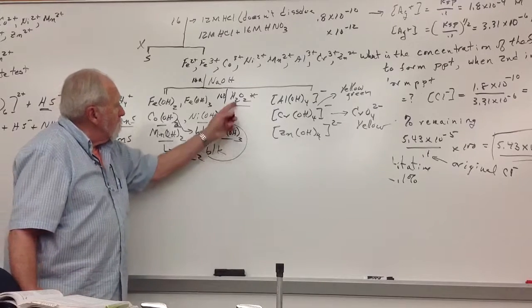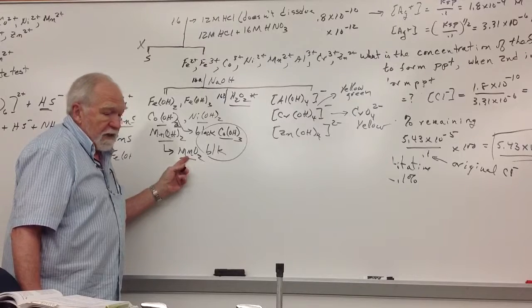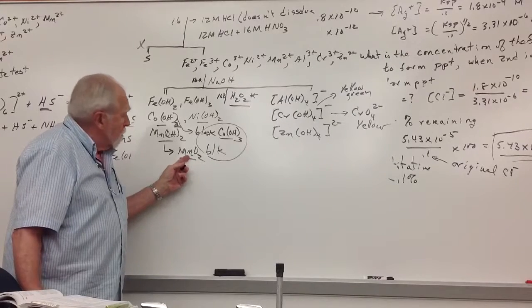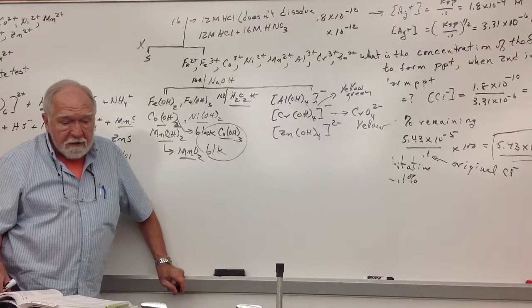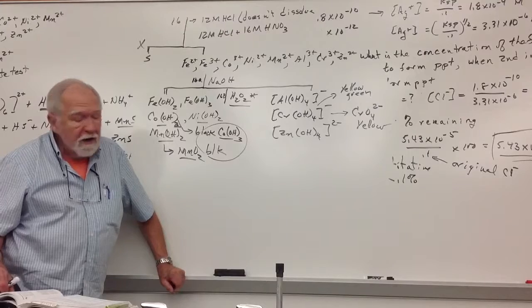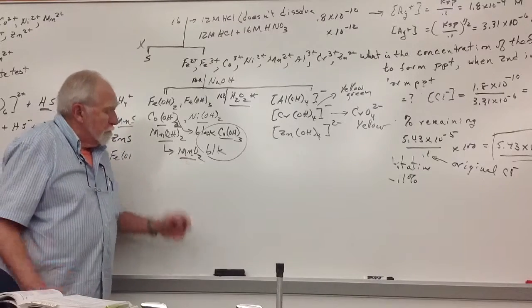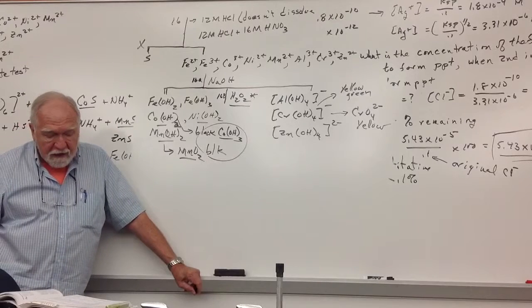But if you don't decompose the hydrogen peroxide, when you're doing the manganese test later on, it will prevent you from seeing the permanganate color, because hydrogen peroxide is very effective at breaking down the permanganate into manganese ion.